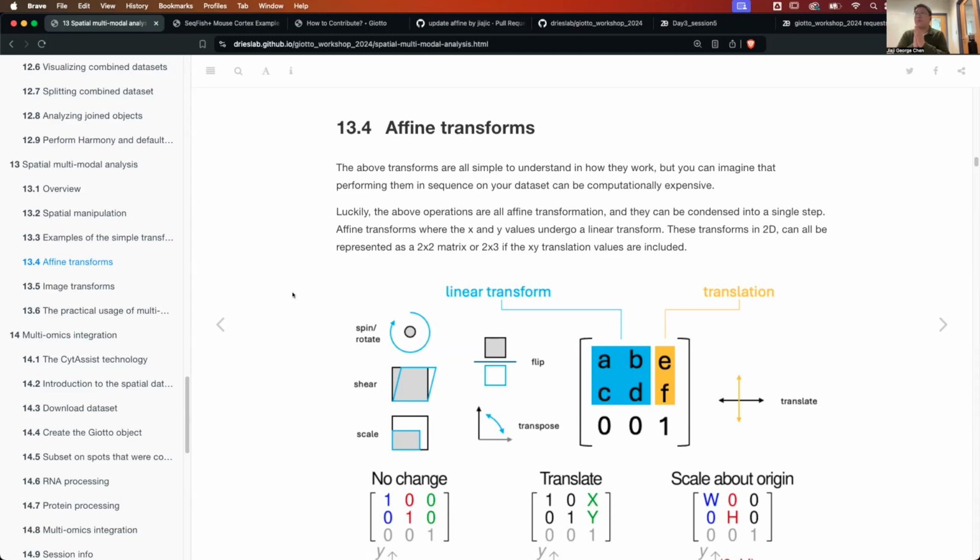So it can't be that 1 to 2 looks like this width, but all the way at like 100 to 101, it looks like this. There's no warping that's ever allowed with affine transforms, but anything that is not warping is perfectly allowed. So it's any of these particular transforms that you can see here.